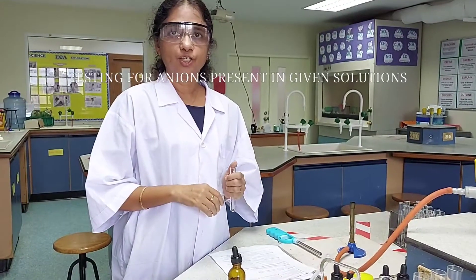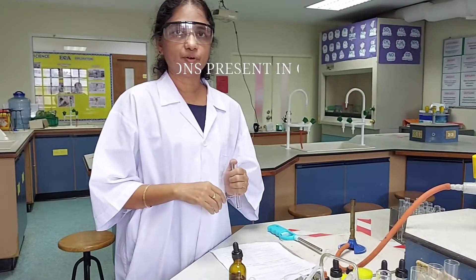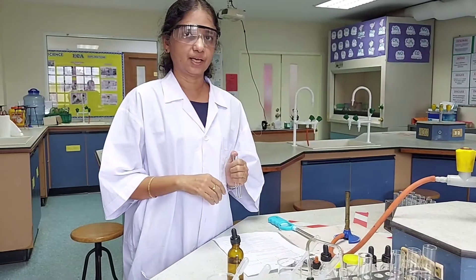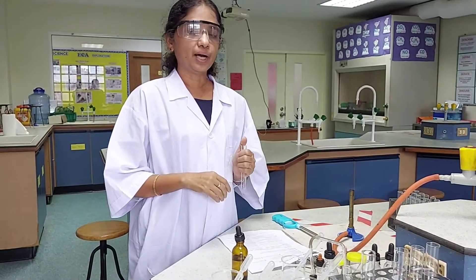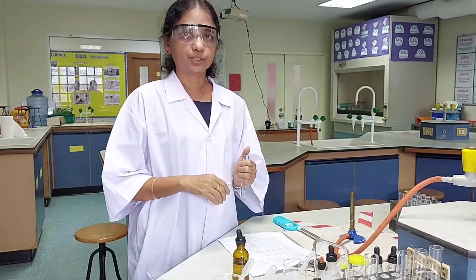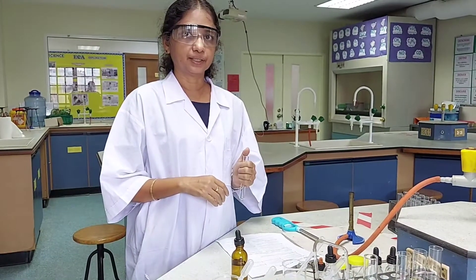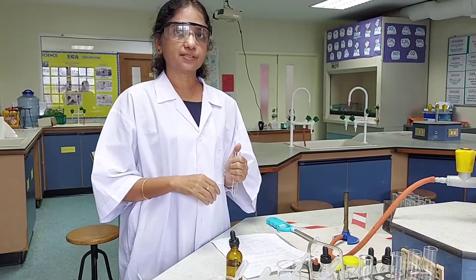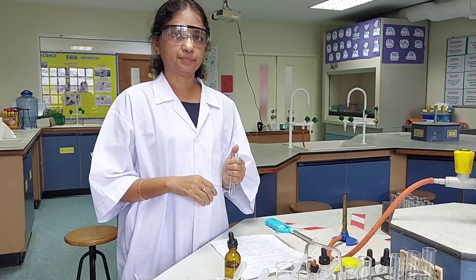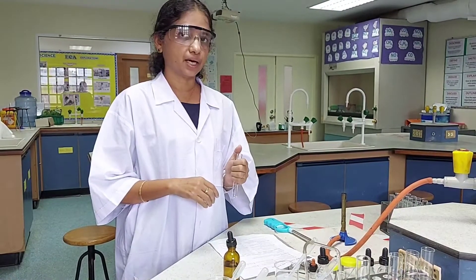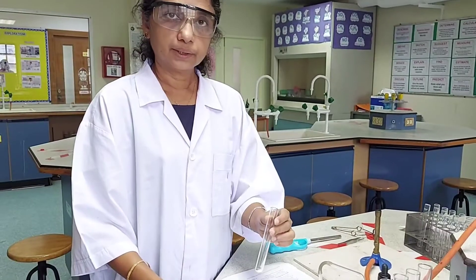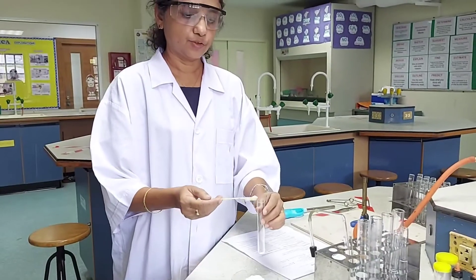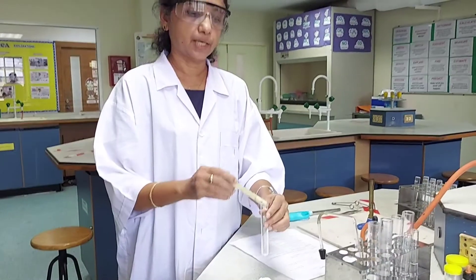This experiment is all about testing for anions present in given solutions. You have to carry out certain tests to identify the anions present. Let's first detect the presence of carbonate. This is an experiment to test for the presence of carbonate ion.